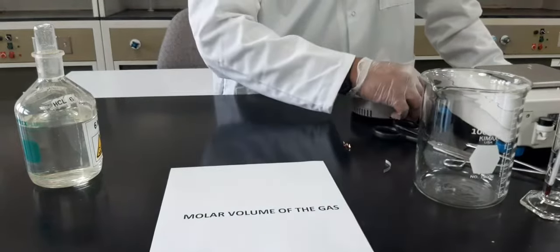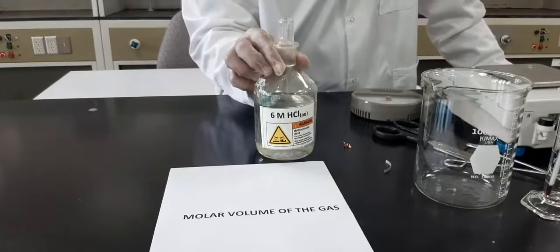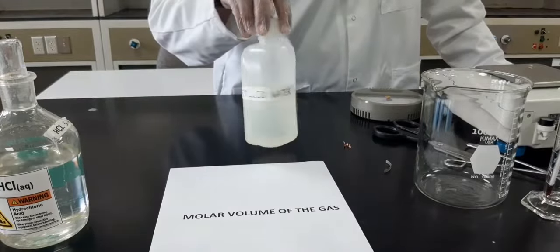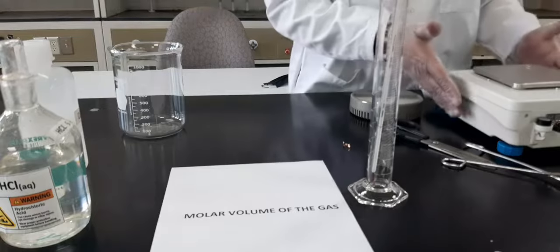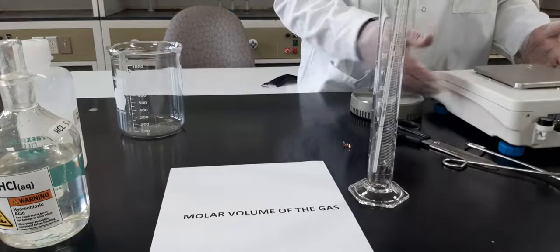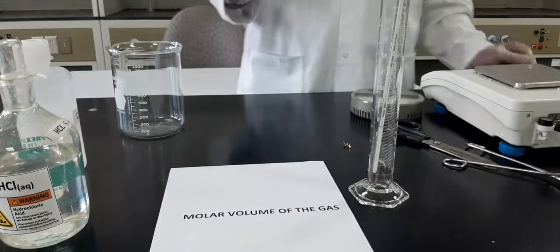Alright, that's 6 molar HCl as a chemical, and we have distilled water. The last thing in here is an analytical balance or digital balance, which is required to measure the weight of the piece of magnesium. So let us begin.